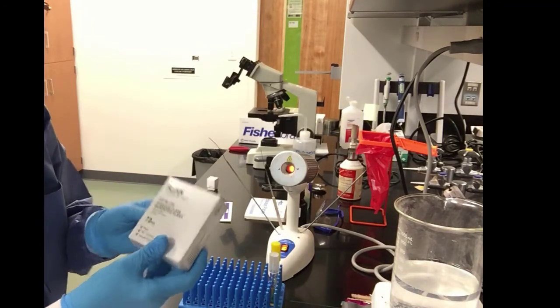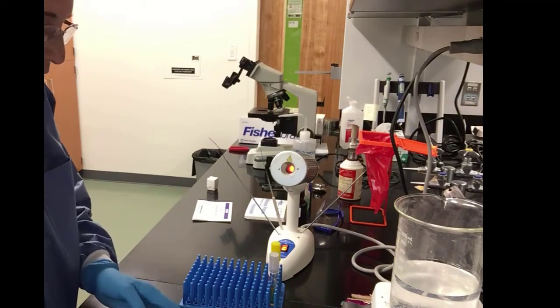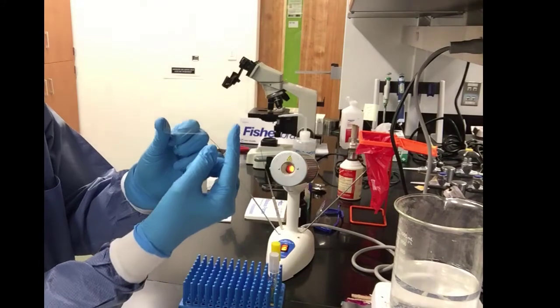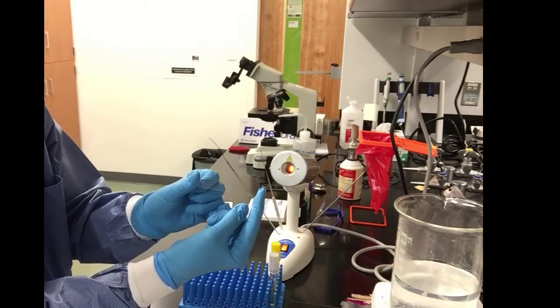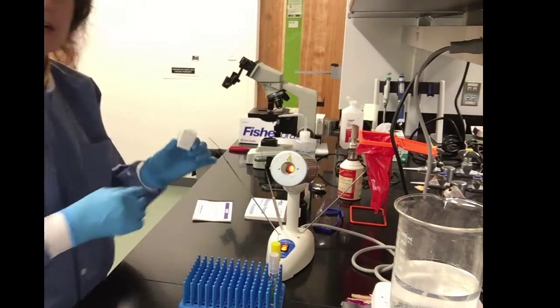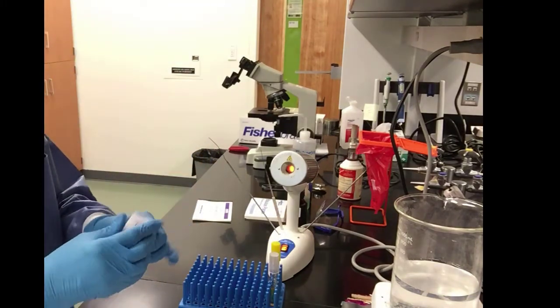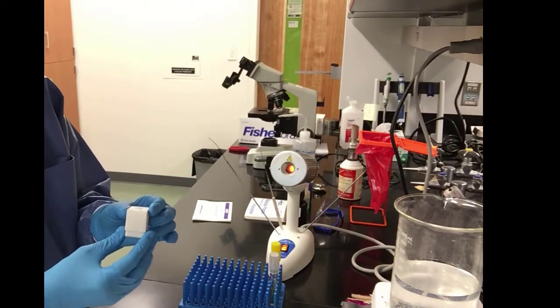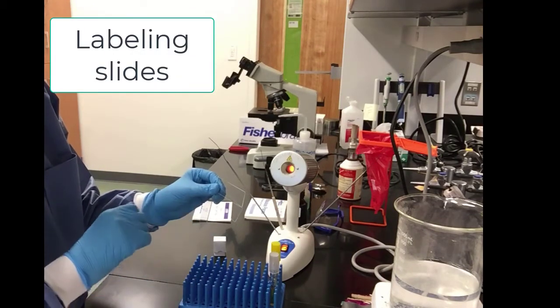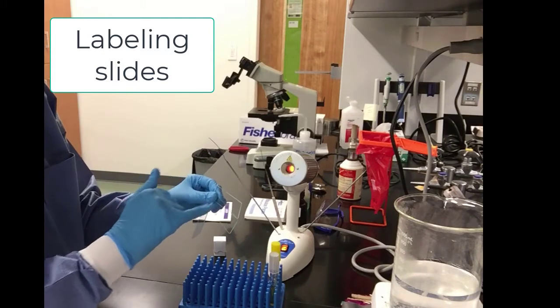These are microscope slides, the regular glass slides. And here's one of those slides right here. We will need 3 of them. So we're going to have 3 slides during this experiment. And we also will need some cover slips. These cover slips are placed on top of the slides to prevent any contamination of our lens.